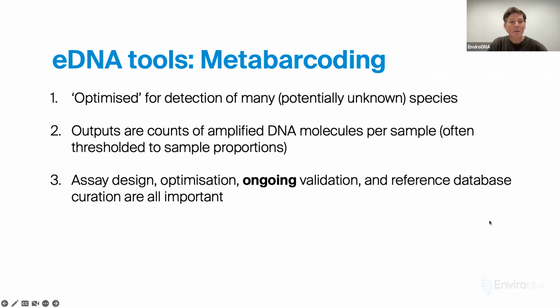And then assay design and optimization requires, again, ongoing validation. A lot of the assays that are in use today are dependent upon the data that was available to them at the time. And reference databases are being filled at a really rapid rate, so that at least opens the possibility for improvement of assays that are in use today, and the generation of new ones that may be more or less specific to target groups.